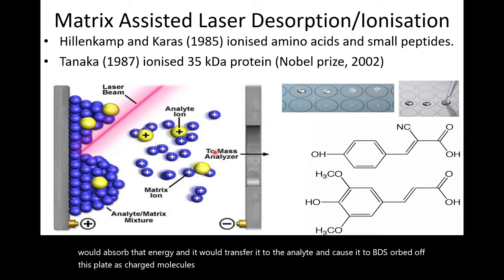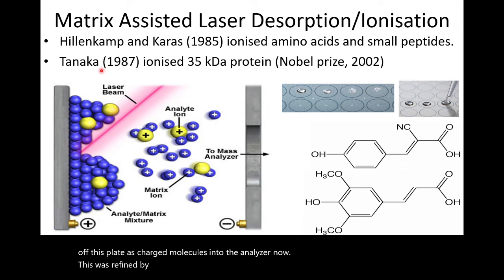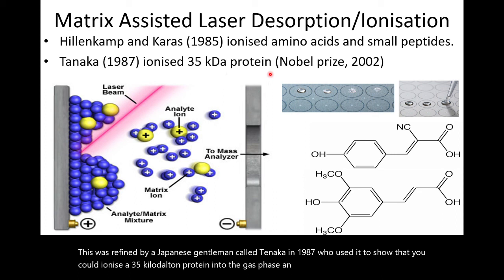Now, this was refined by a Japanese gentleman called Tanaka in 1987, who used it to show that you could ionize a 35 kilodalton protein into the gas phase and measure its mass. And for this, he won the Nobel Prize in 2002.